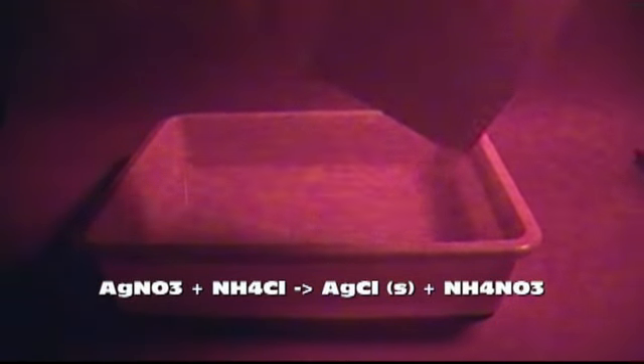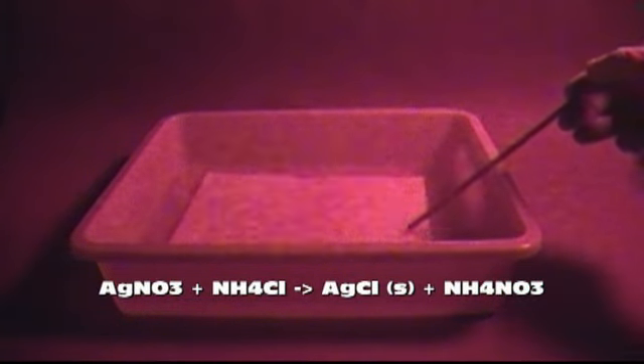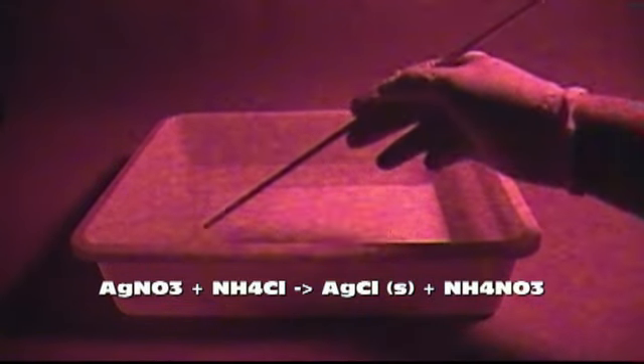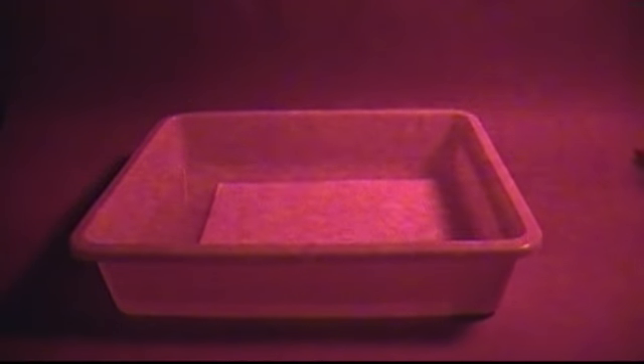The next step will need to be done in the dark or in dim lighting conditions. Take one of the dry sheets of paper and submerge it into the bath of silver nitrate. The ammonium chloride will react with the silver nitrate in a double displacement reaction to form ammonium nitrate and silver chloride. The silver chloride is not very soluble in water and will precipitate out of solution, however it will stay in the paper due to the egg white binder. This is why we can't just add silver chloride to the egg whites and apply it directly — we need to precipitate it out into the paper.